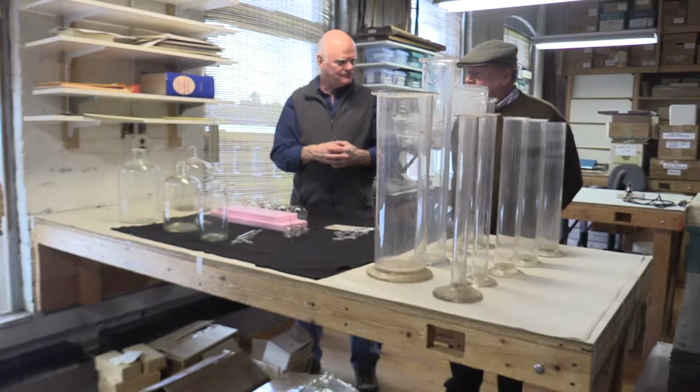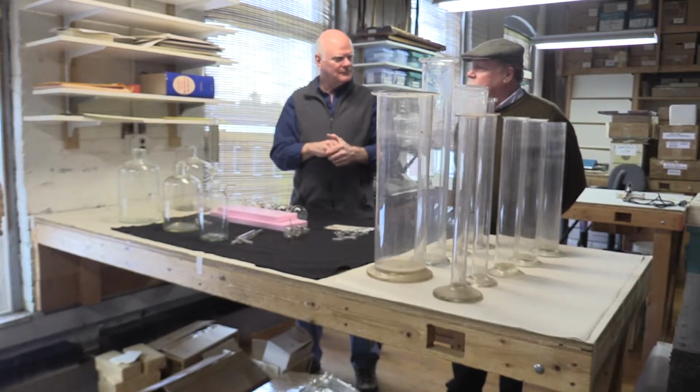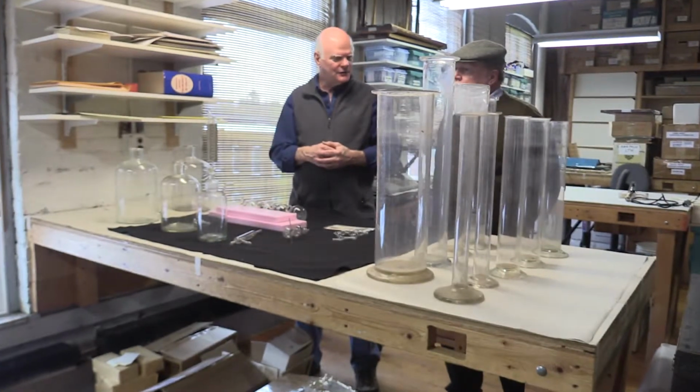You were talking once before about Pyrex? Pyrex was the Corning version of it. Pyrex was released as chemical glassware in 1915, so 100 years ago.